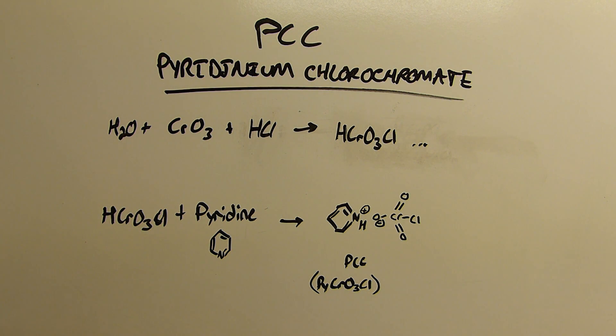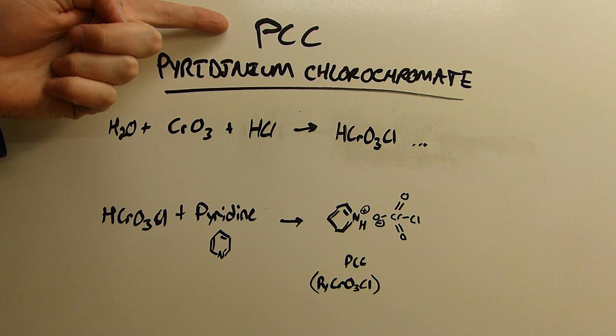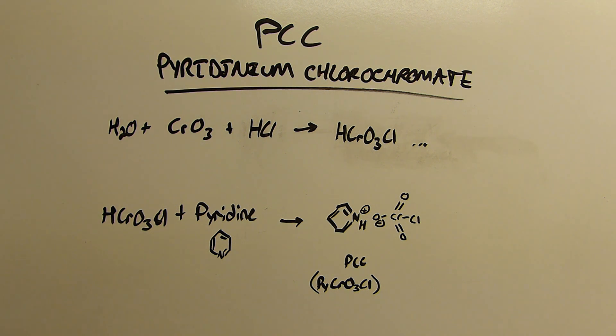Hi everyone and welcome back to the lab. In this video I'll be making a compound called pyridinium chlorochromate or PCC for short. It is the quintessential textbook method for oxidizing alcohols to aldehydes without over-oxidizing them to carboxylic acids like potassium permanganate might do.